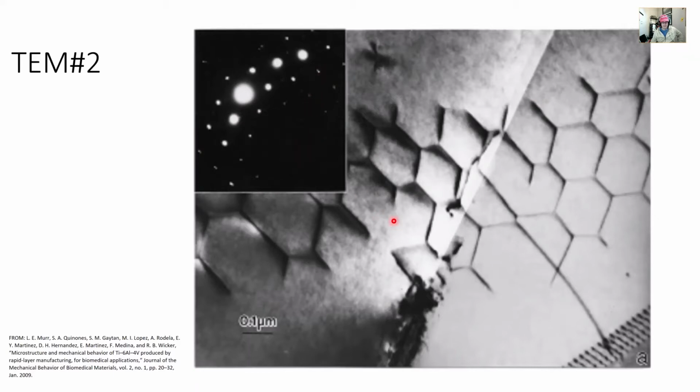Very interesting. Have a look at this article if you want to learn more about it, but very beautiful, very nice imaging. Again, combining real space and reciprocal space to figure out what's going on. I'm not doing a very good job interpreting this, other than showing you that there are these really cool dislocation cells, this array of dislocations showing up, and a really cool honeycomb structure.